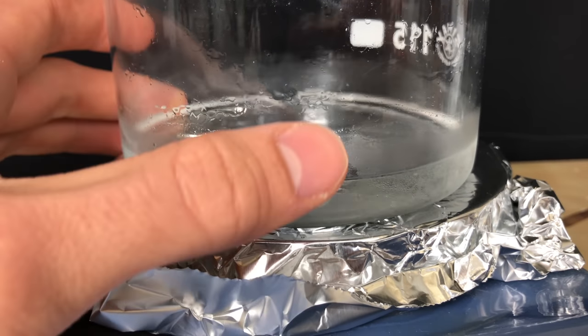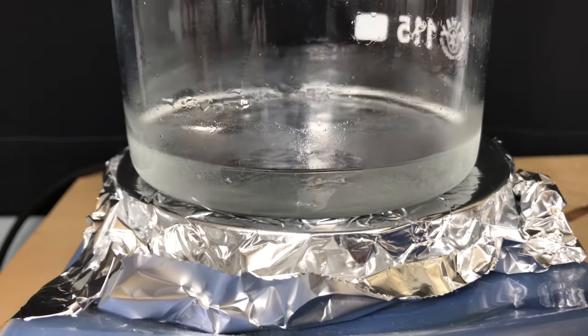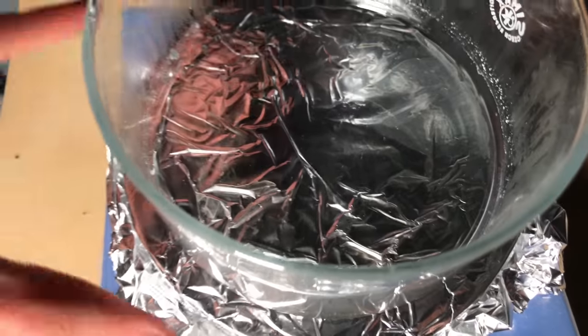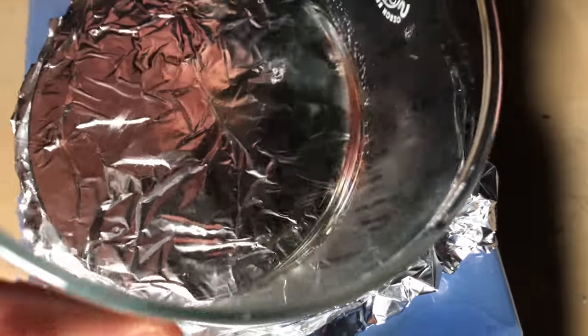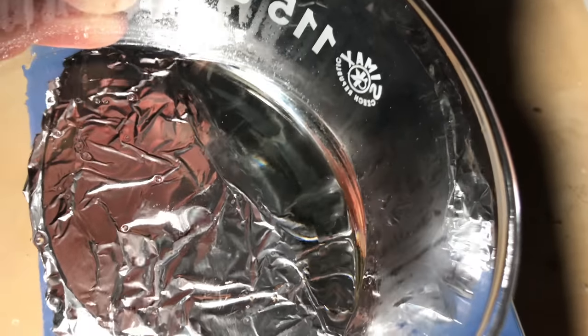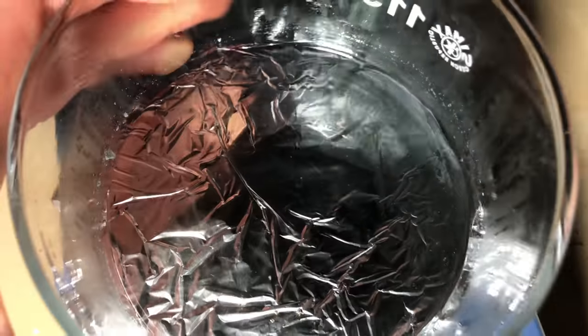To evaporate off the DCM gently, our hot plate was set to 52 degrees Celsius and it was boiled off. In the end it looked like this, and because it was still liquid, I put it into my vacuum chamber over anhydrous calcium chloride.